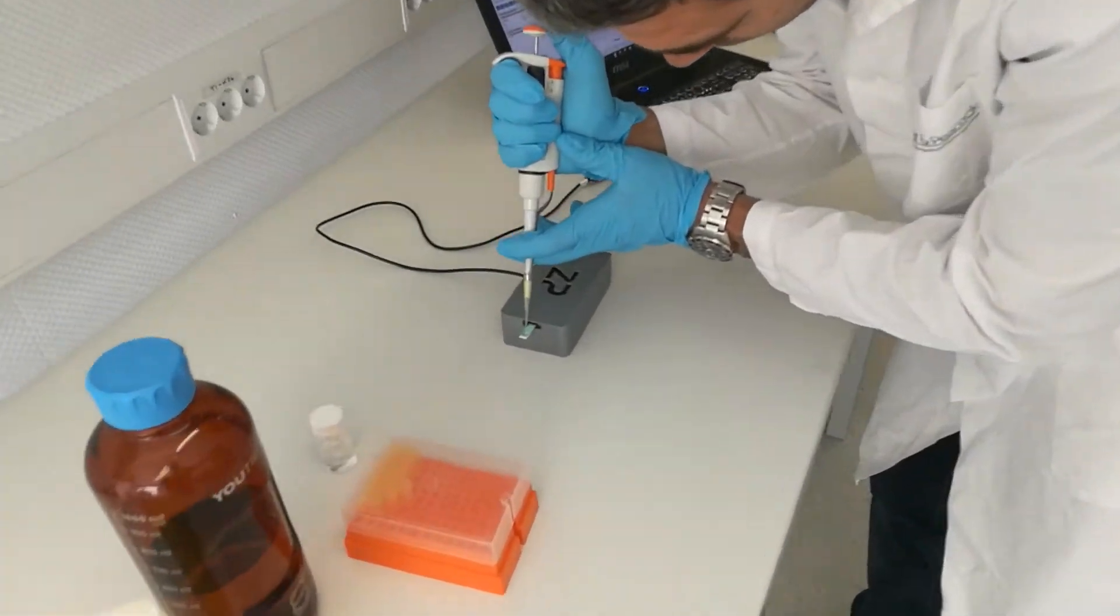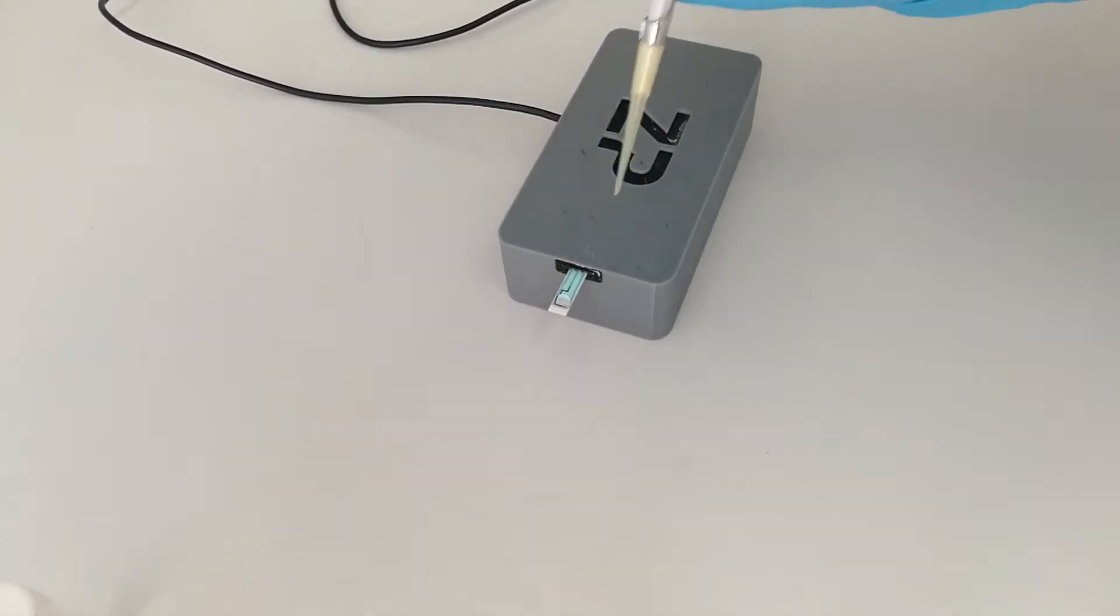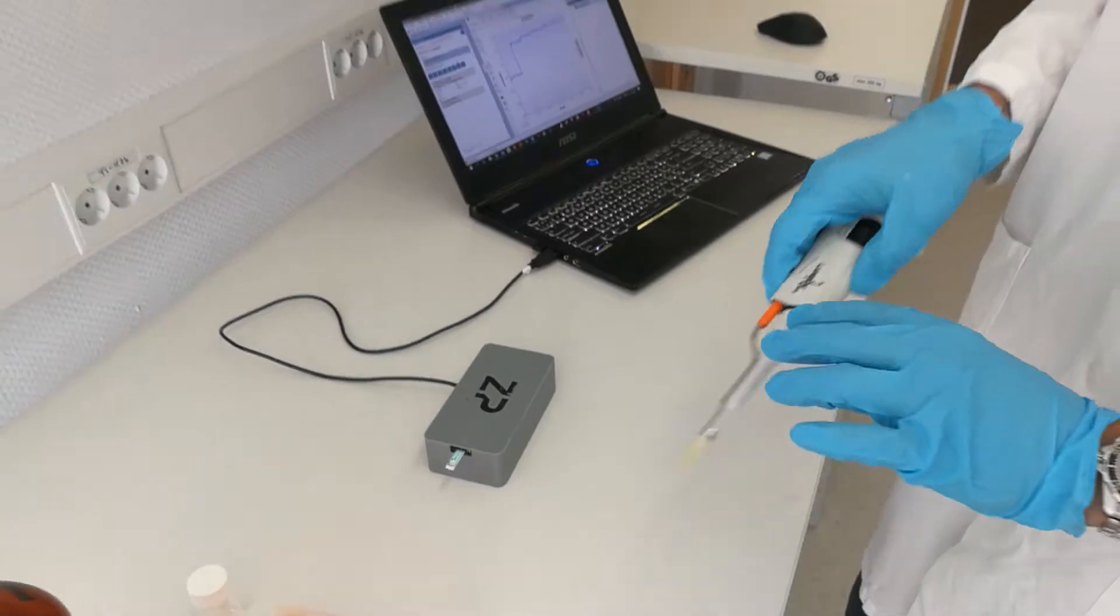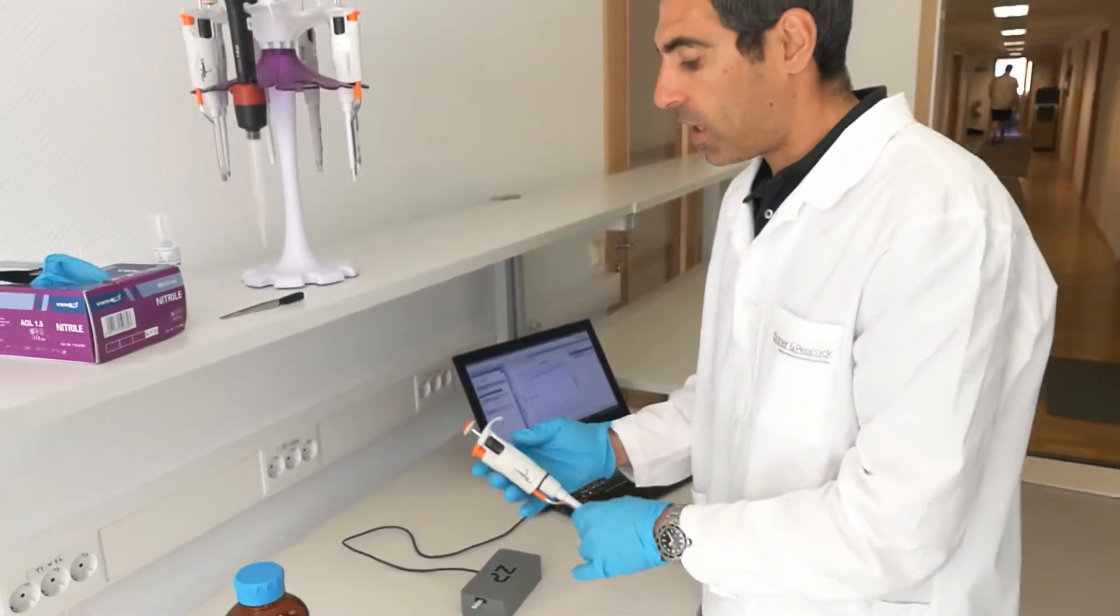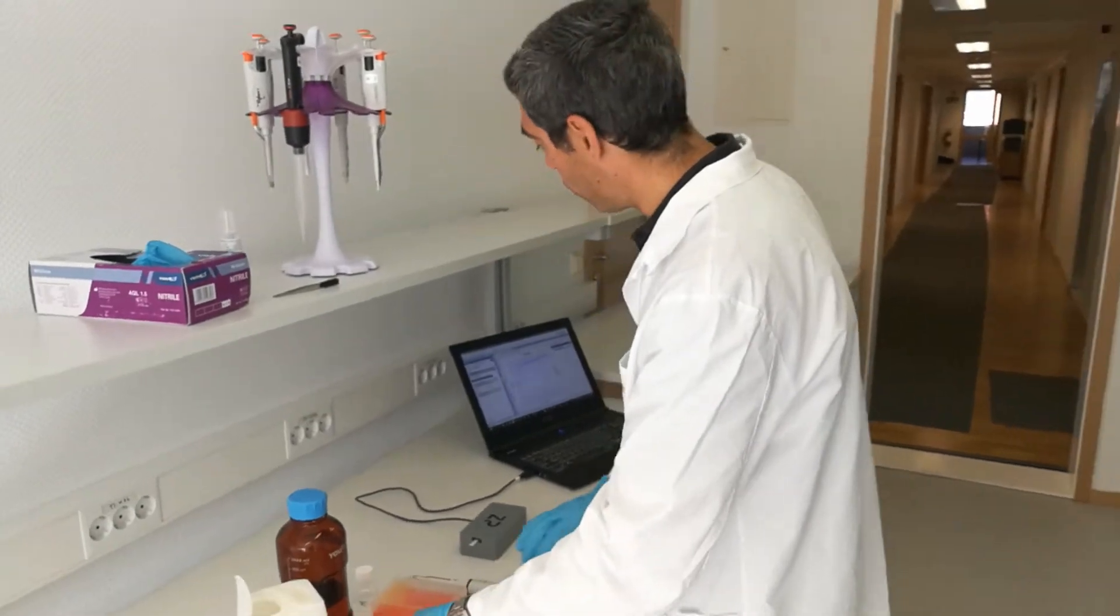It is important to have some chloride in the solution because the reference electrode is made of silver silver chloride. That means you will deplete the electrode if you don't have any chloride in the solution.